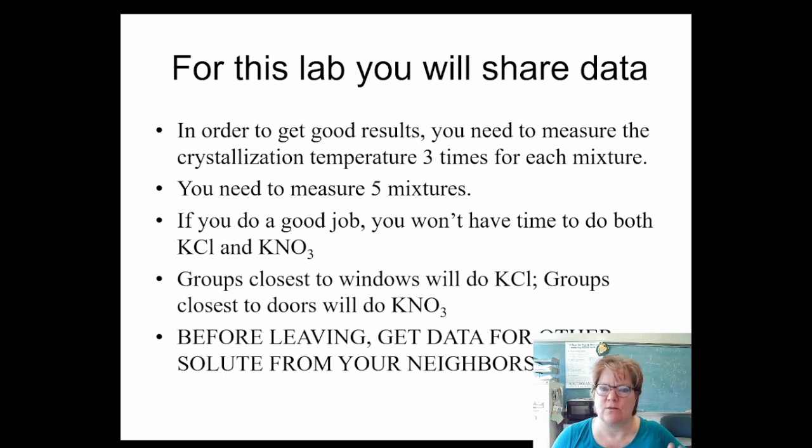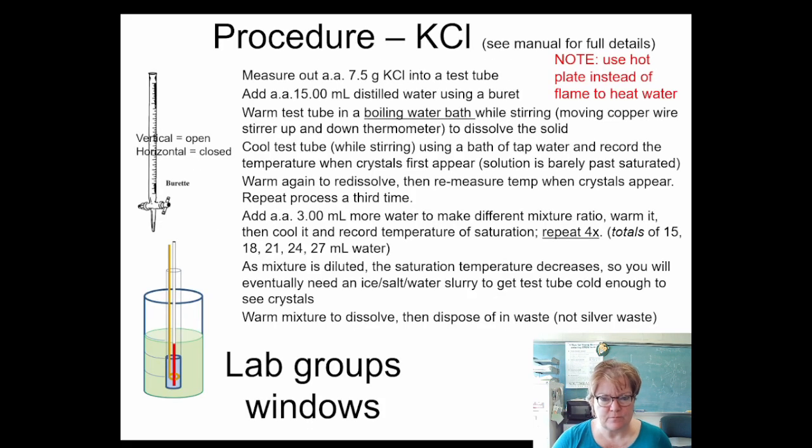I've assigned randomly the ones near the windows are going to do KCl, and you're going to then swap data with the group next to you. And we'll keep track of which ones, make sure I know which ones you did and which ones you got from the other lab partner. So if it's KCl, and there's almost the same difference between the two of them.